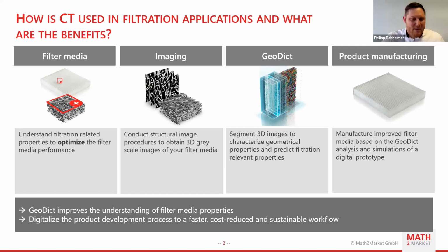In the process then, the image stacks from the micro-CT undergo segmentation. So this means that we assign pore or solid phase to the grayscale image. And here our software, of course, provides the classical segmentation algorithms such as Otsu or k-means, for example. But additionally, we also offer artificial intelligence tools for segmentation. So these apply pre-trained neural networks to the image.